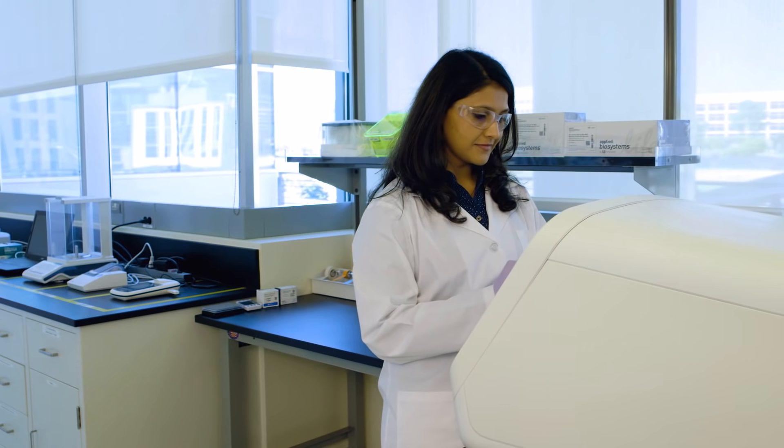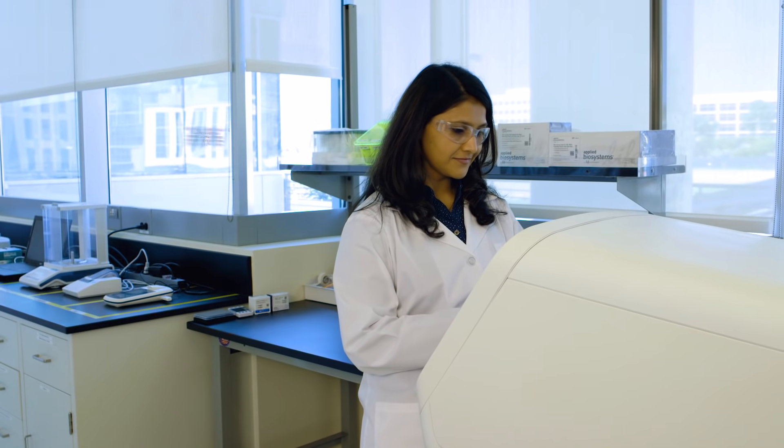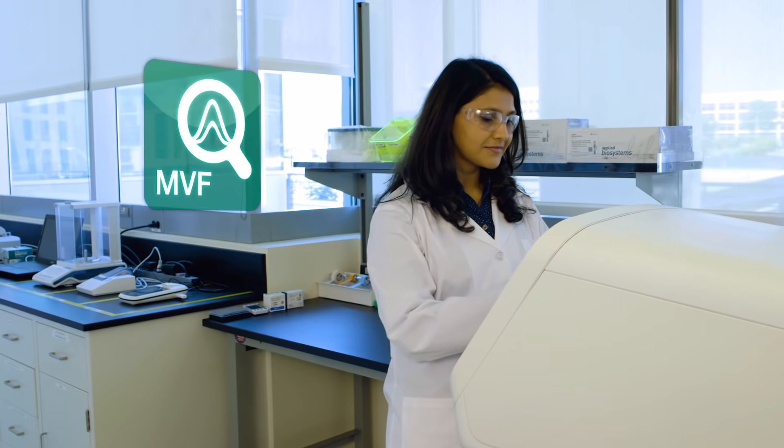Or share data with your collaborators. Secondary analysis is now included with your system, including minor variant finder software for detection down to 5%.